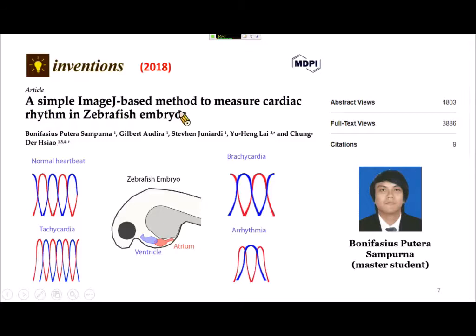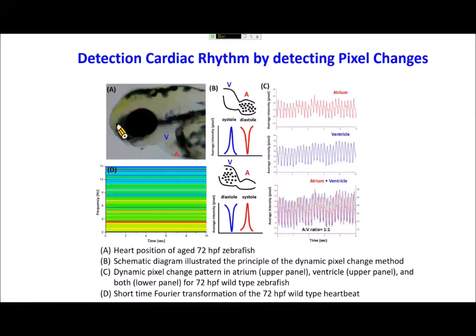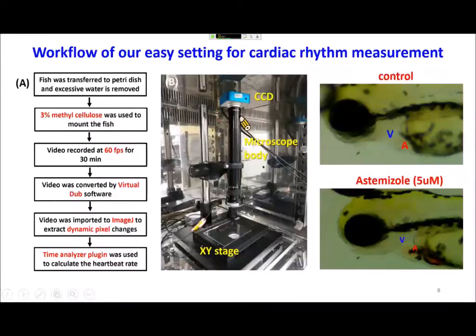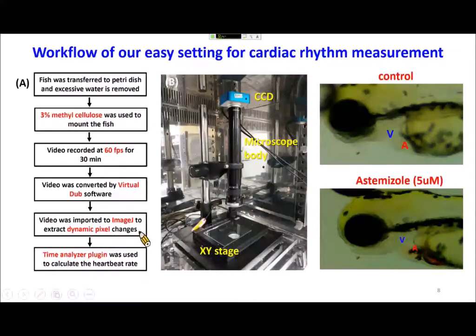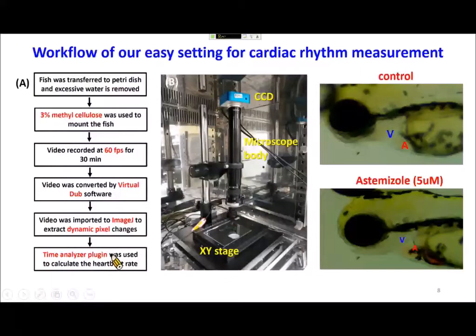In this protocol, we use ImageJ to analyze the signals from the atrium and ventricle, and eventually quantify the cardiac rhythm. The setup is very simple: a dissecting microscope coupled with a camera or CCD, and an XY motorized stage for fine adjustment of zebrafish position. We record zebrafish images at 60 frames per second, then use ImageJ to extract dynamic pixel intensity, and finally use a time analysis plugin to analyze the sequential chronology of the heartbeat.